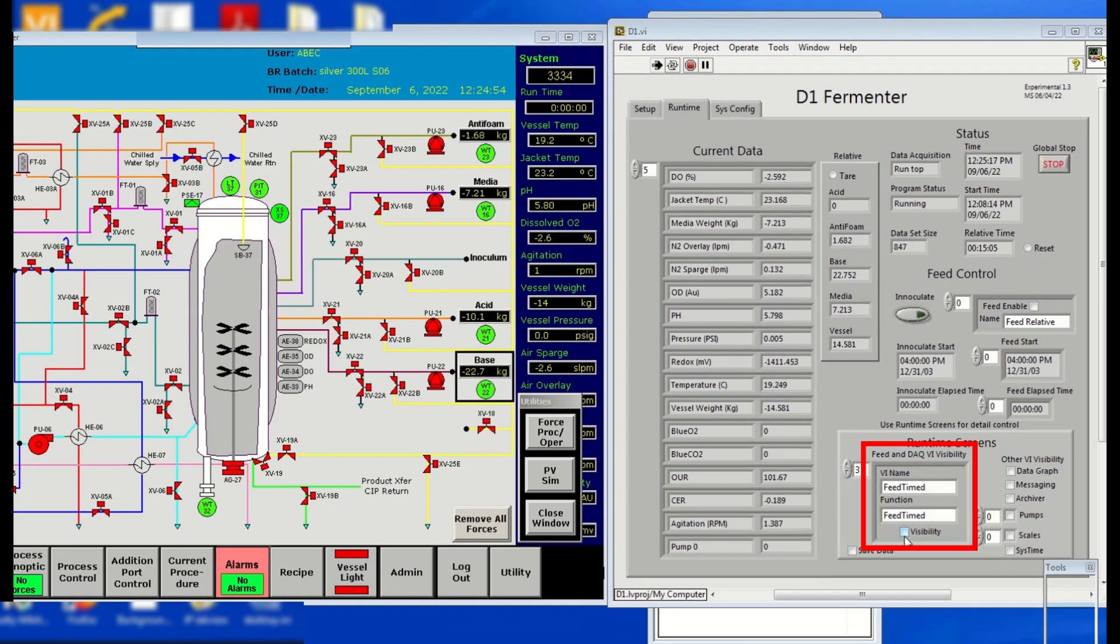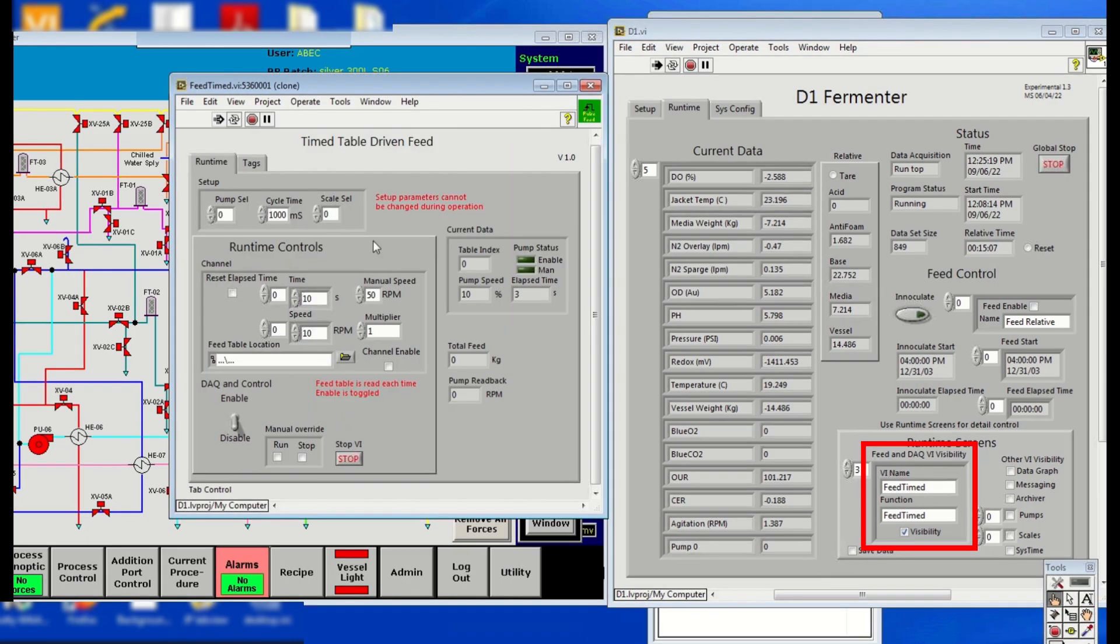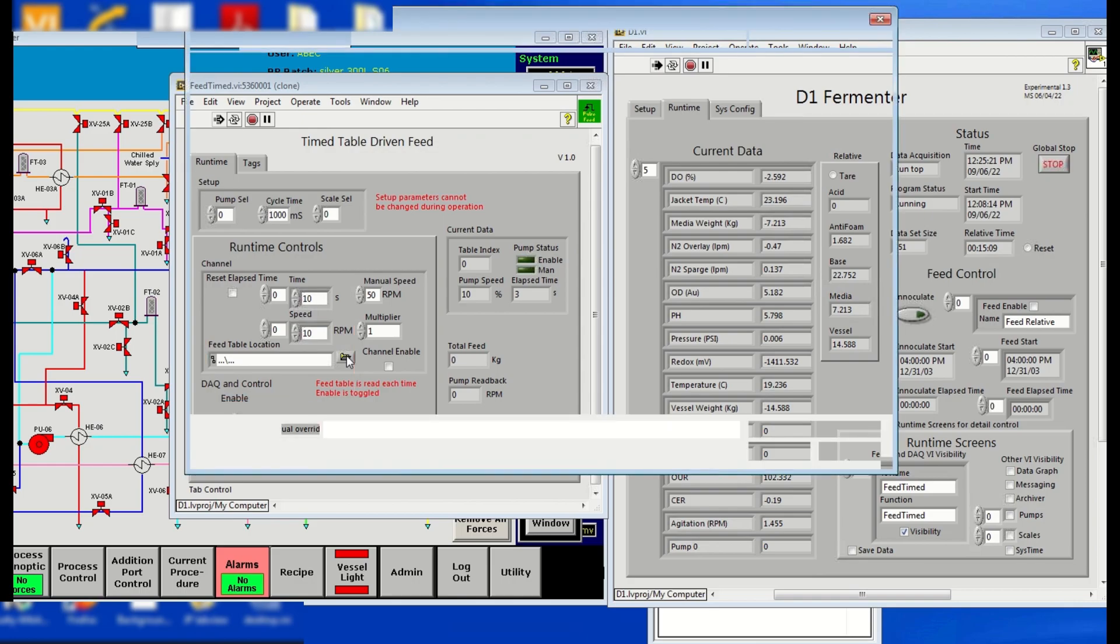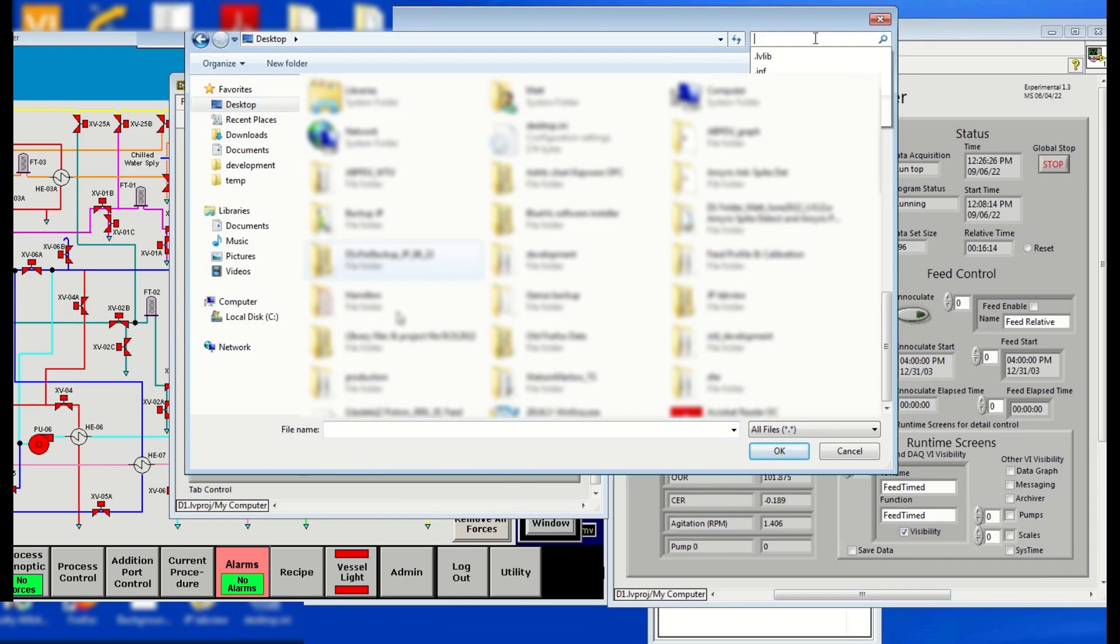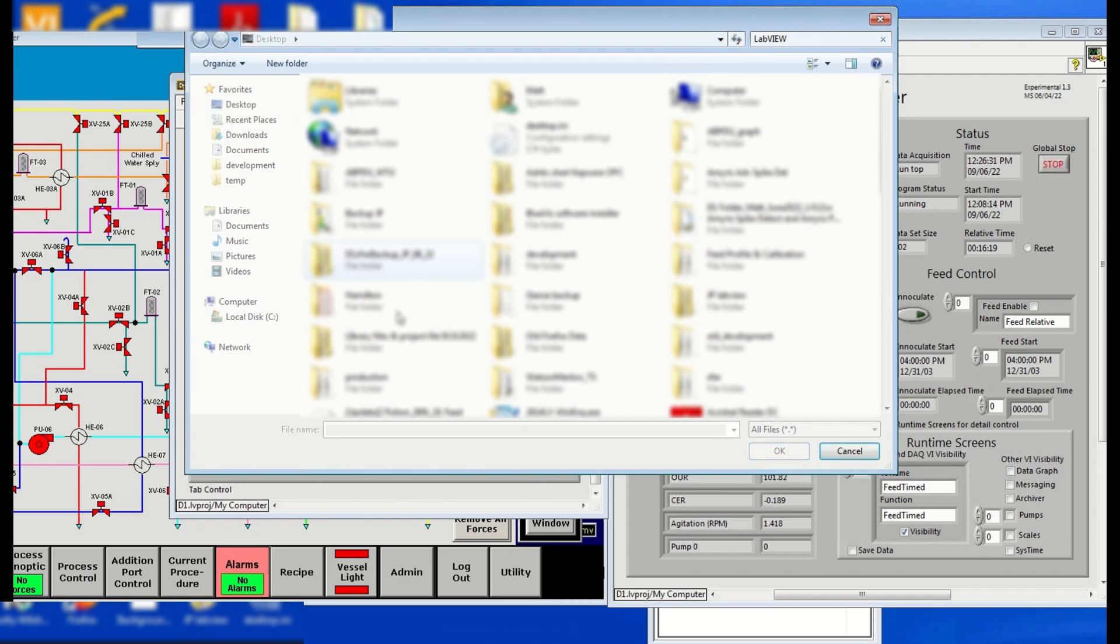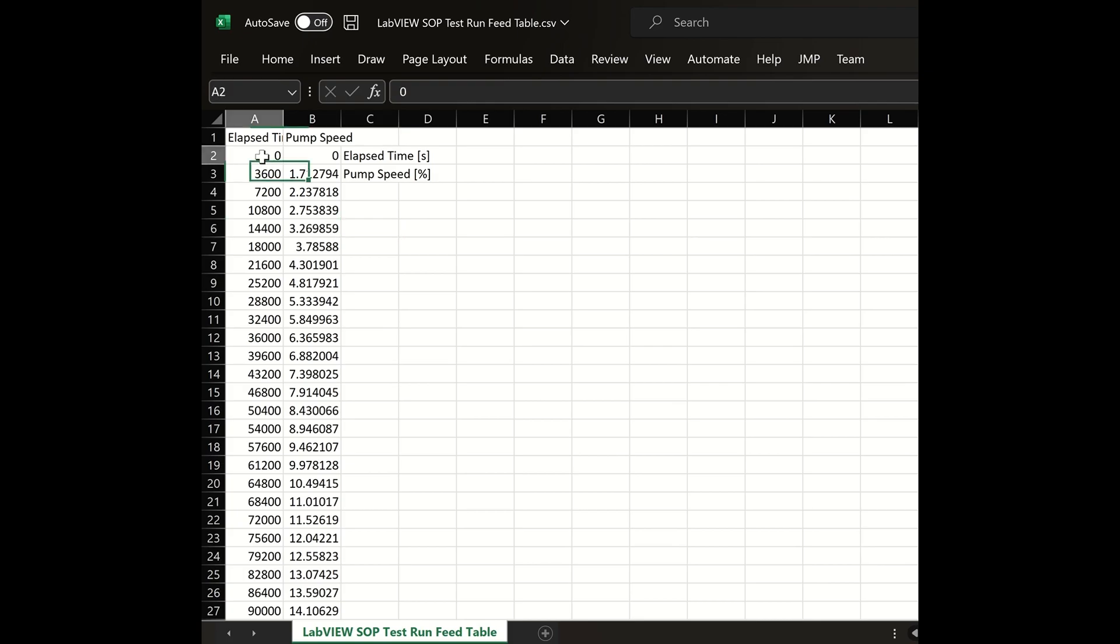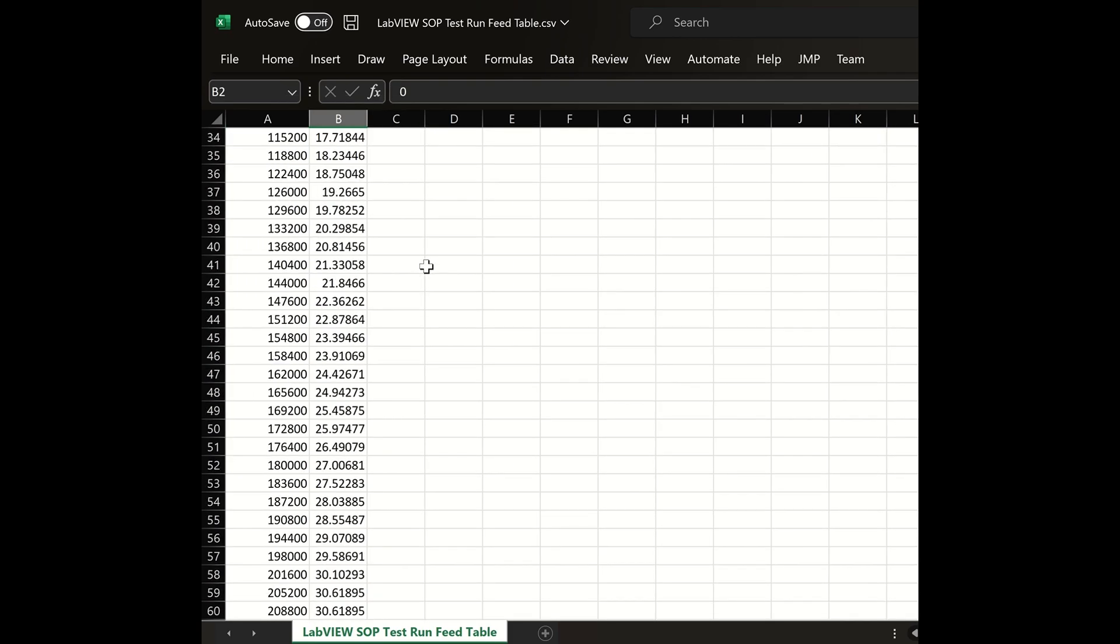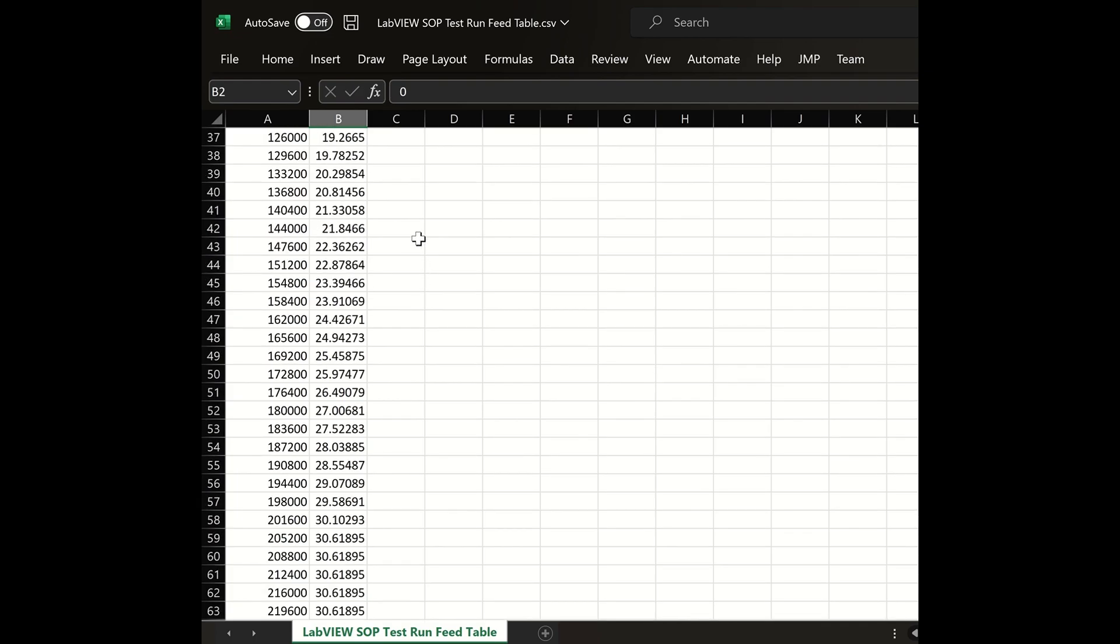The Feed table specific for each project is loaded in the Runtime panel. Our loadable feeding strategy is used here for demonstration. In the Runtime screens, click Visibility to display a panel for Feed name Timetable-driven Feed panel. Click on the Feed table location folder and locate your file for the Feed table. Note, the Feed table must be in a .csv file and the format should have the elapsed time in seconds on the first column and the Pump percentage on the second column.